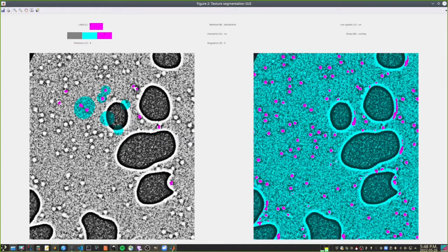Okay, most of the fibers are good. Yeah, the rest is quite good. But it's finding stuff, it's labeling fibers where there aren't any. So I went back to blue, and you see already it removed the majority of the mistakes. This is probably a mistake.